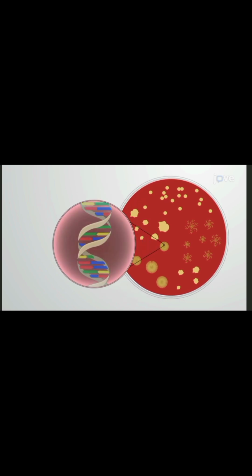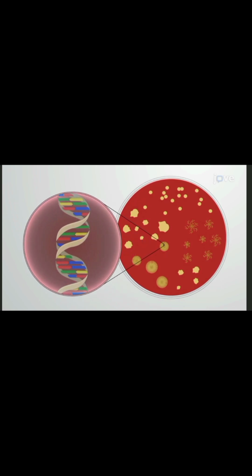media to observe colony morphology. Genetic analysis, another technique for identifying bacteria, has grown in popularity in recent years, due in part to 16S ribosomal RNA gene sequencing. The bacterial ribosome is a protein-RNA complex consisting of two subunits.